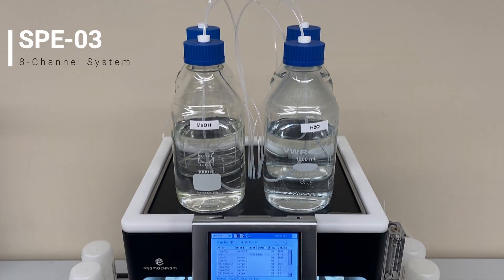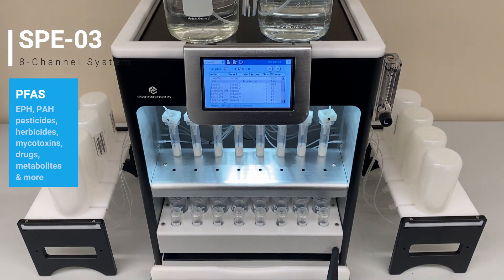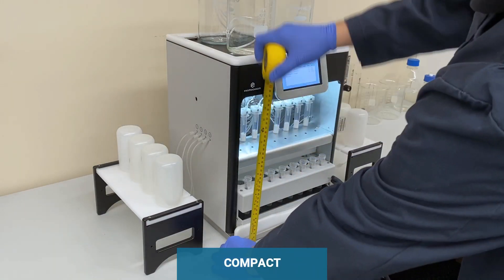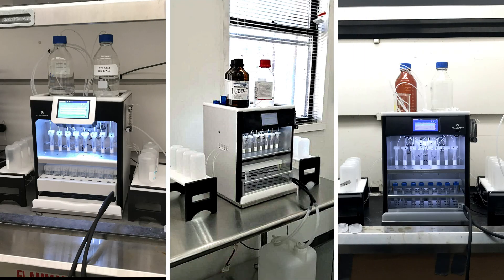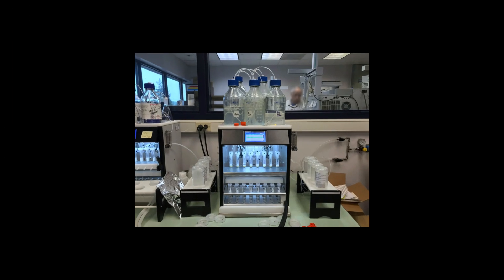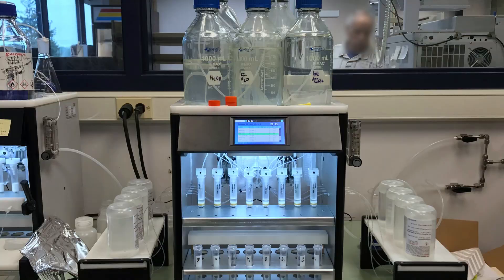The SPE03 8-channel system has become a popular system for PFAS and many other types of extraction, due to its high efficiency, compact design, clean background, and good recovery. Since 2018, it has been used for EPA Method 537.1, DOD, and other modified methods. More recently, it was used during the multi-lab validation for EPA Method 533.